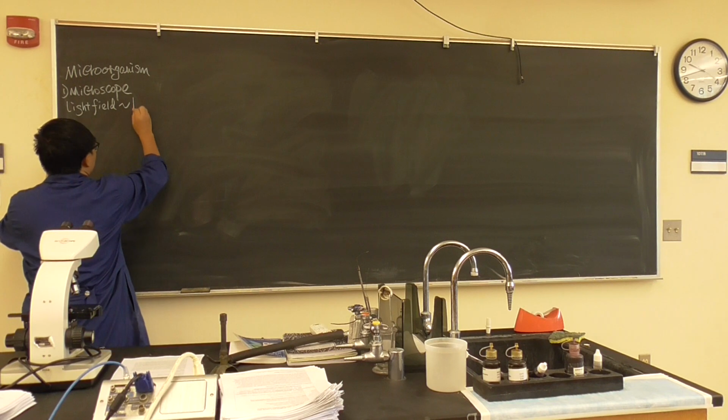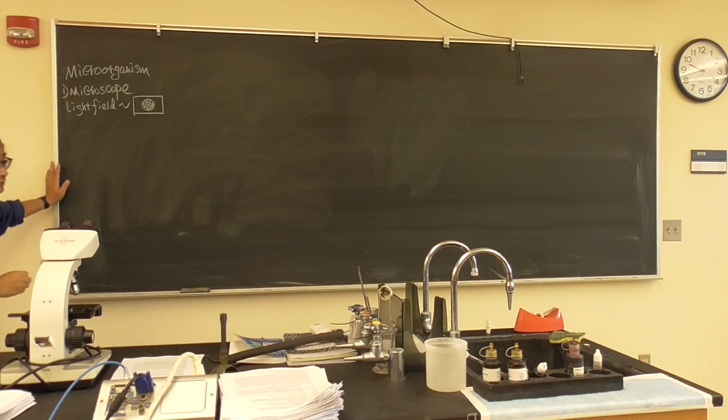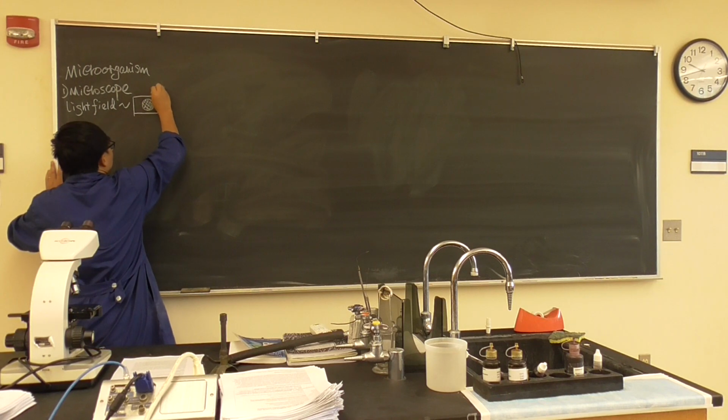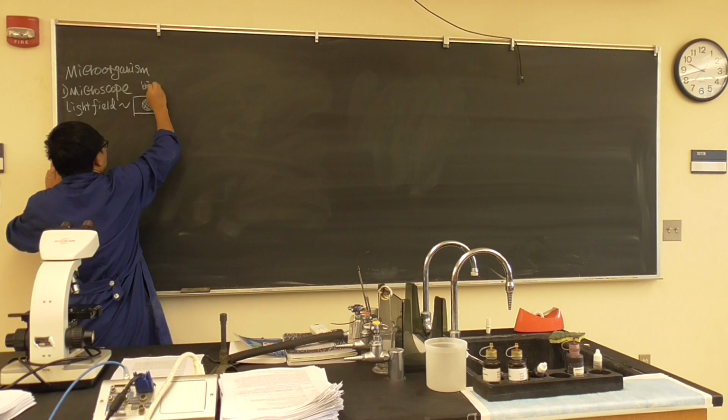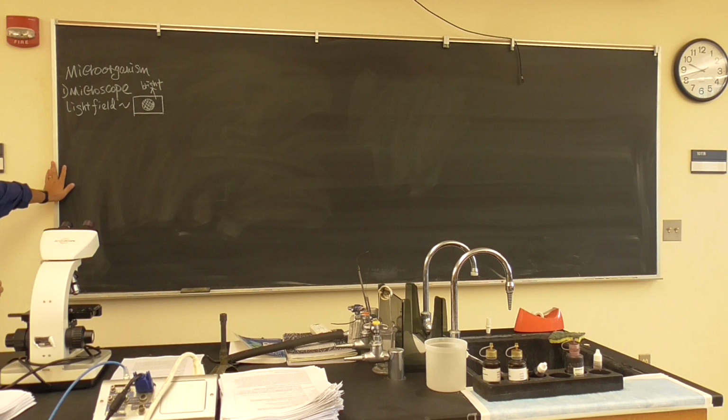Underneath the microscope, you will have the sample, which is stained or using the dye, which shows up the color, and the background is bright. So we call it bright field microscope, or we say light field, bright field microscope. Okay, so that's the first thing first.